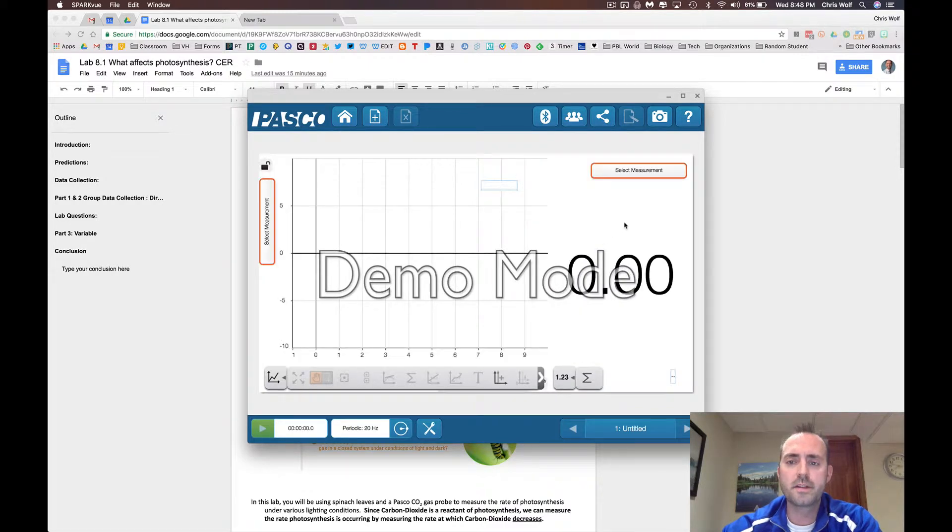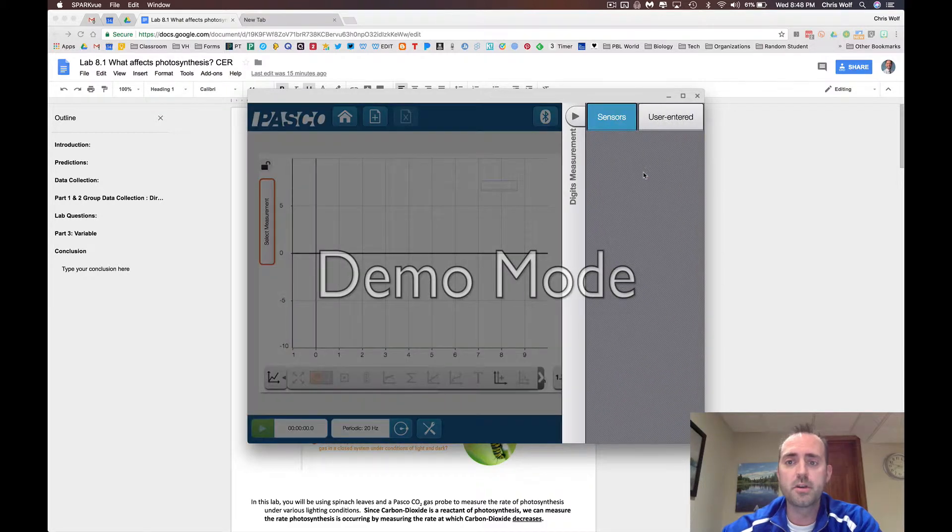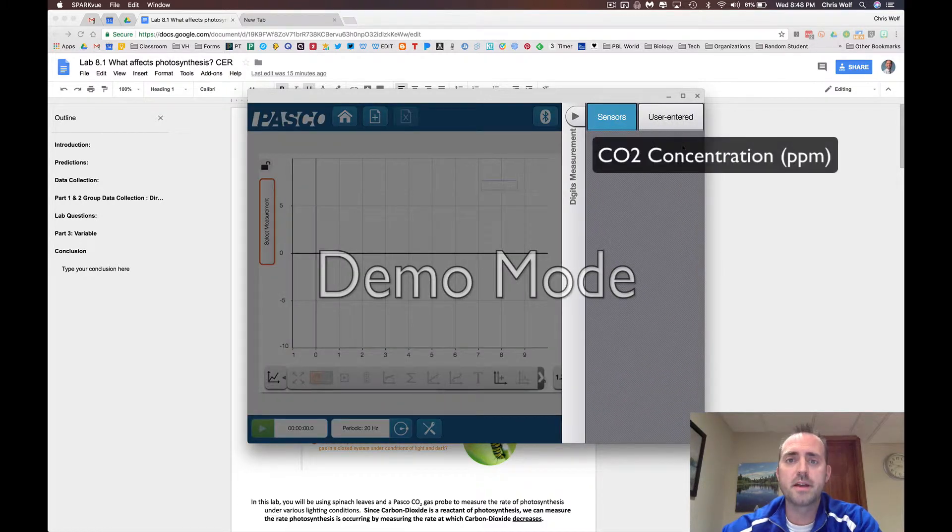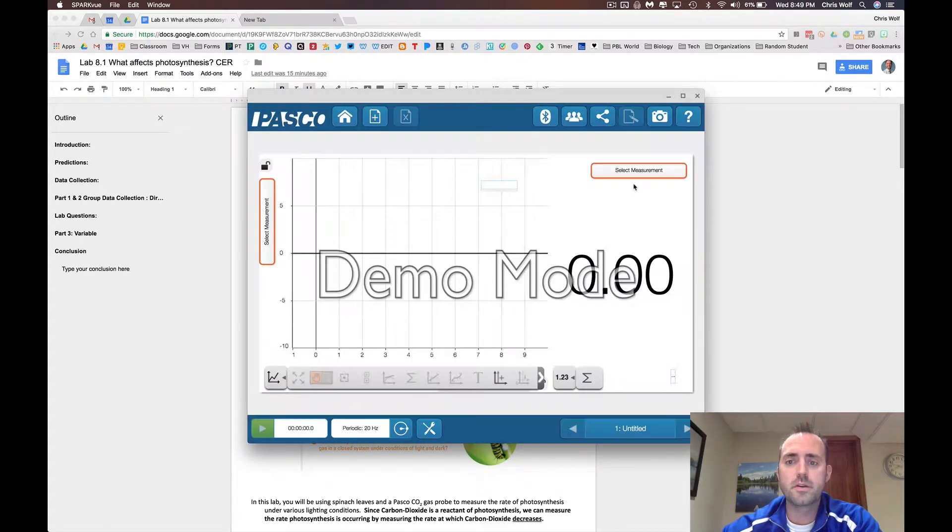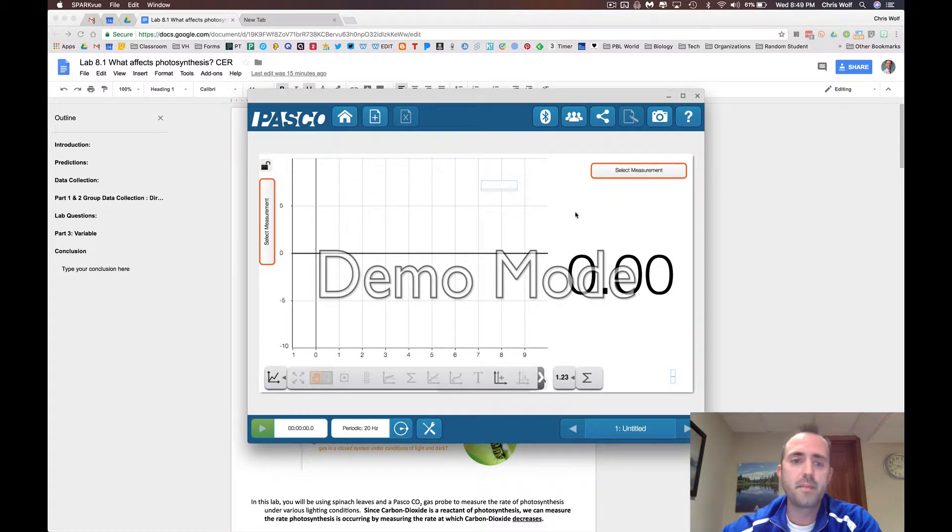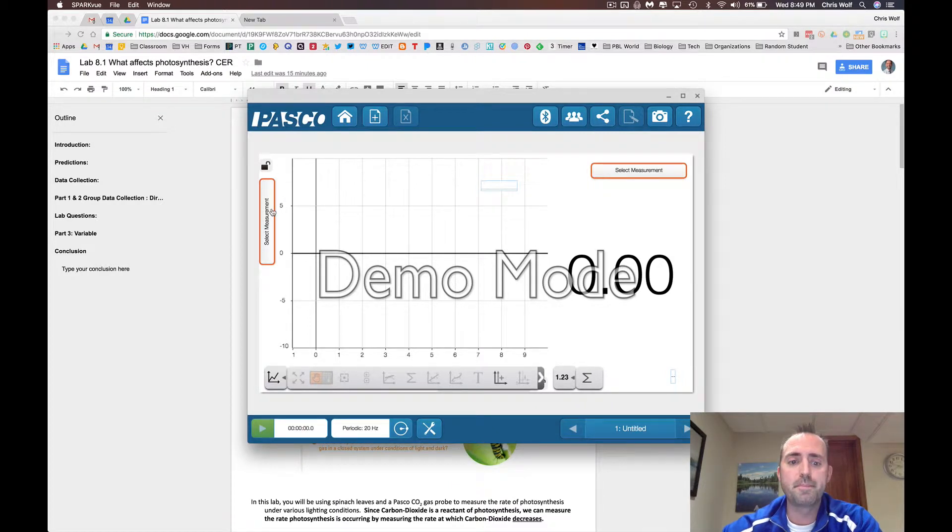Don't forget to select the measurement you'll be taking during the lab, which in your lab will show up as a carbon dioxide concentration sensor here. You need to select this both for the digital readout and for the data that will be graphed during the lab.